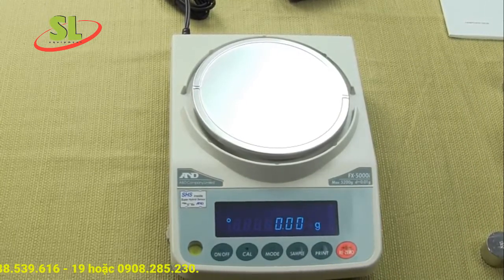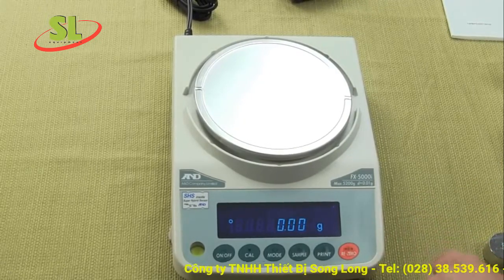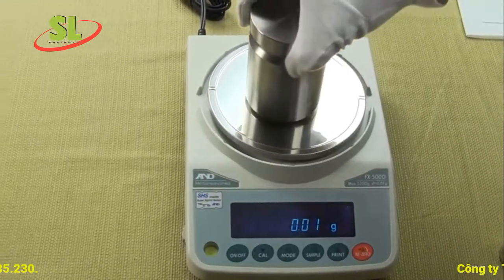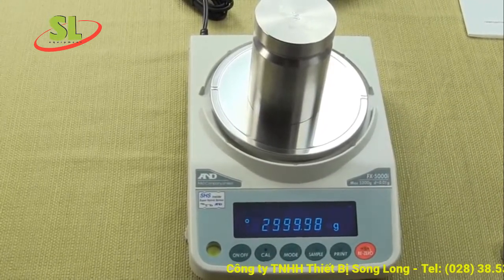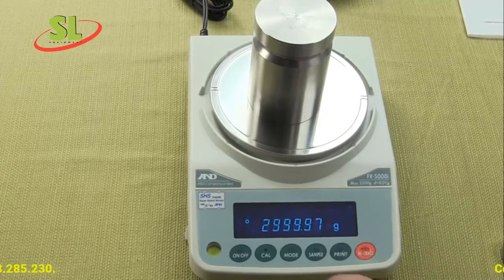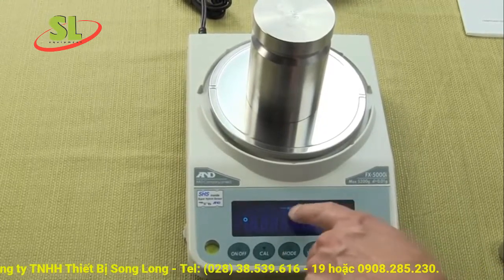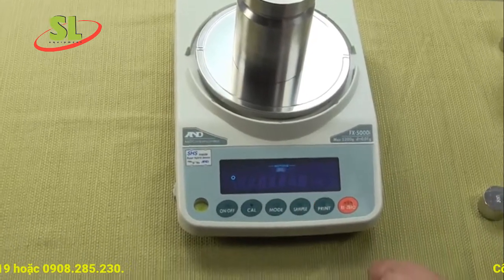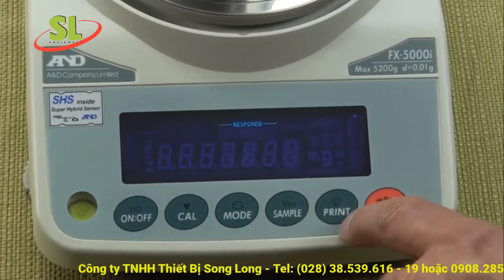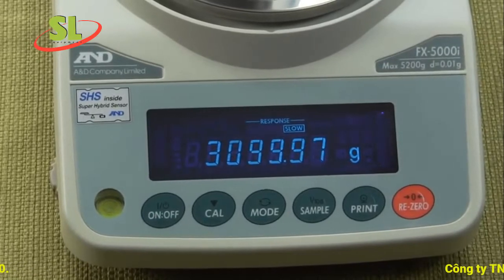The balance has a parts counting feature. The presets for parts counting are 5, 10, 25, and 50. You also have the ability to change the response time. Simply press and hold the mode button — you'll see response mode options. Press the mode key to switch to slow mode, then press the print key to store it. You can observe the balance is noticeably slower in slow mode.